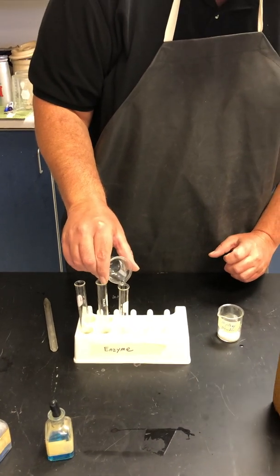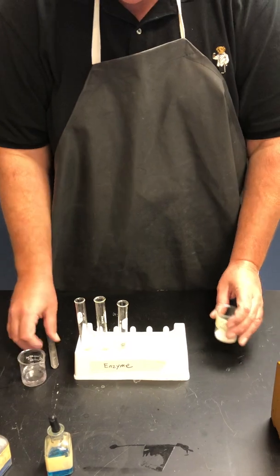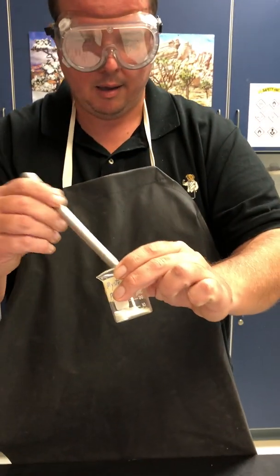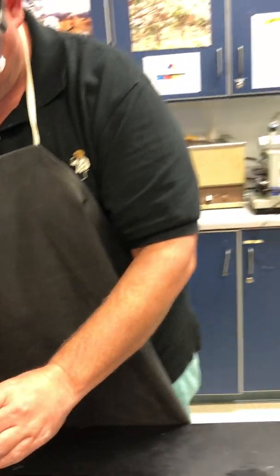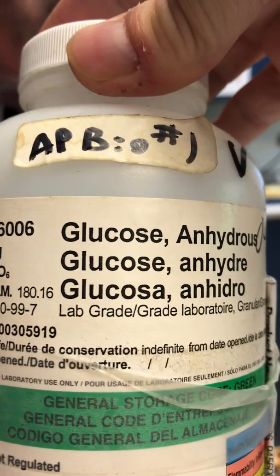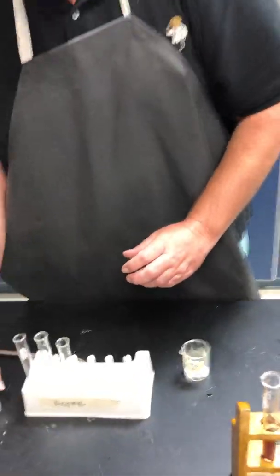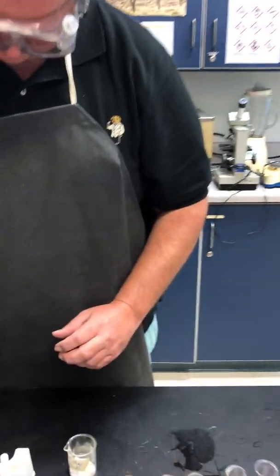So we're testing for 3 different things. We don't know what's in the mystery powder, but it could be 3 different things. It's a white powder, and I had 3 powders to work with. One of them was this albumin, which is a protein. One of them was glucose, a carbohydrate. And the other one is starch. And they're all white powders.